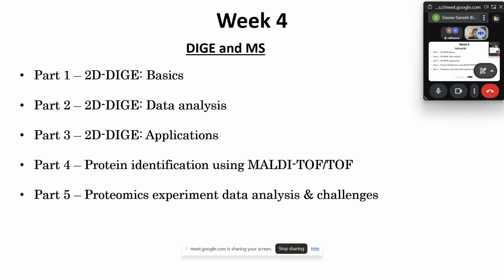Now in this week 4, we'll be dealing with another gel-based proteomics technique, which is DIGE, and the name itself tells you differential gel electrophoresis. We'll basically be dealing with differential expression in different samples, and all those things can be done in one gel itself instead of using multiple gels. If you use sample analysis by two-dimensional gel electrophoresis, you need to run multiple gels depending upon the type of samples. Whereas if you are using dyes, the benefit is that you can pool multiple samples together and run one gel itself. And within a gel, you can visualize differently what might be present in each sample. That's what the DIGE technique is.